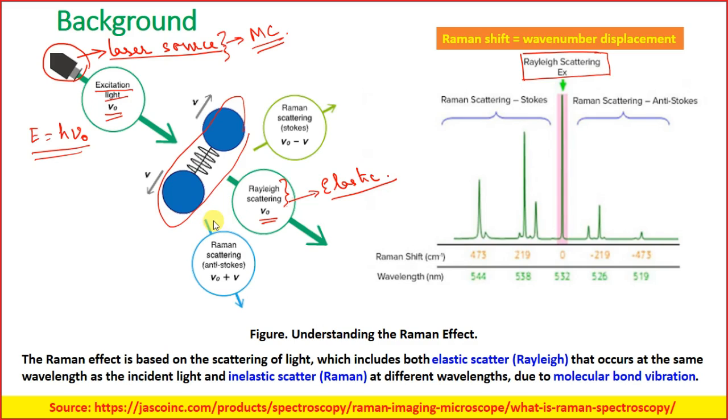In addition to the Rayleigh scattering, there are other scatterings also, wherein you have the energy which would be equal to h mu 0 plus or minus h mu.